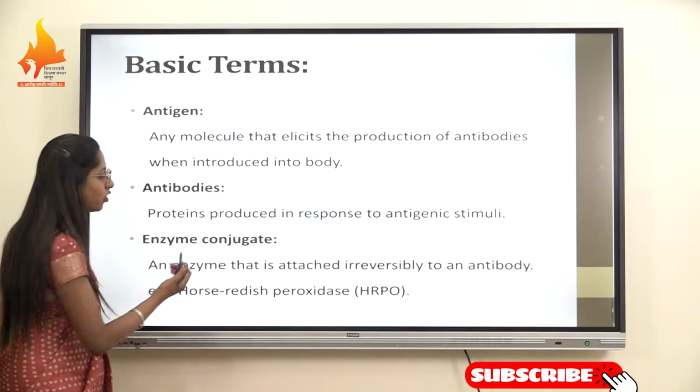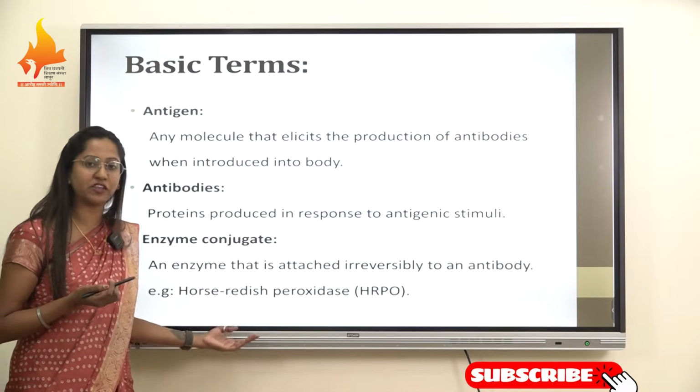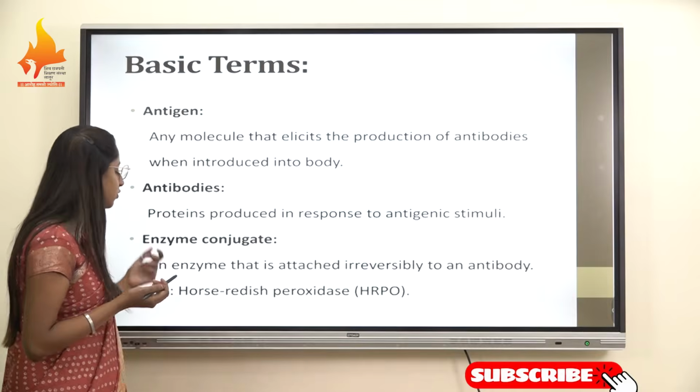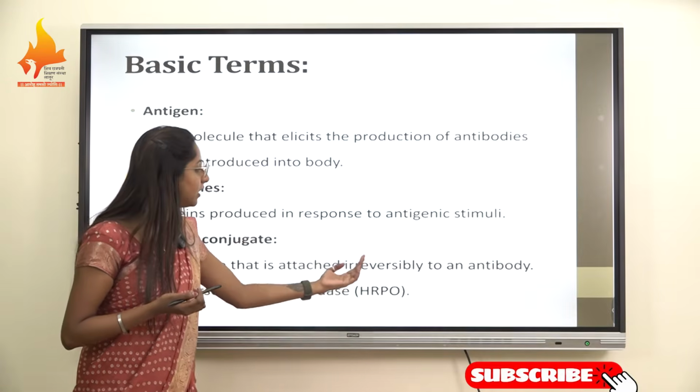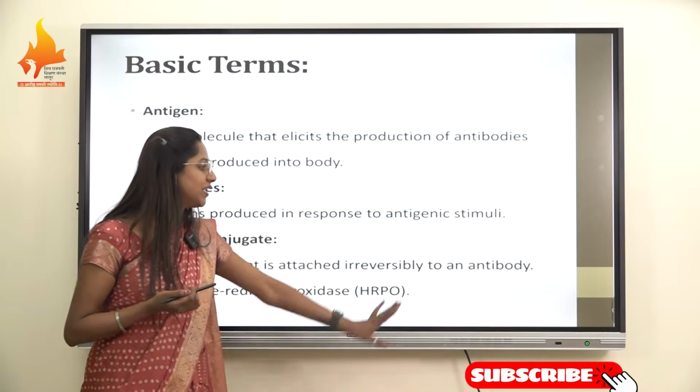Next is enzyme conjugated. As we have discussed, based upon the full form, that was called enzyme linked. Here, an enzyme is attached irreversibly to an antibody. What does that mean?